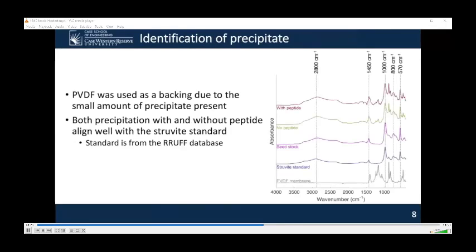To ensure the crystals seen were actually struvite, we analytically examined them through ATR-FTIR. To collect the spectra, we first put the crystals on a PVDF membrane backing to ensure the crystals reached the FTIR. Comparing our samples to a standard struvite from a database, we see very good alignment. There are residual PVDF peaks in our samples because it was present as a backing. Through FTIR, we are convinced that we are making struvite in our high-throughput method.